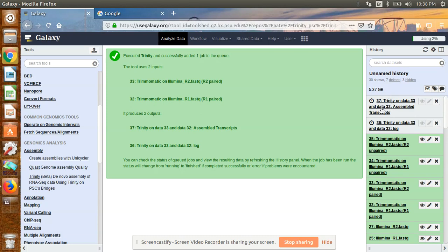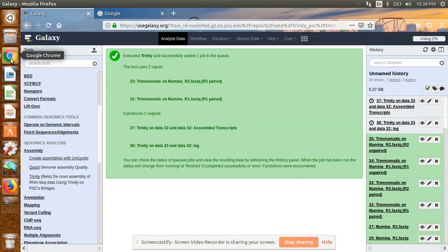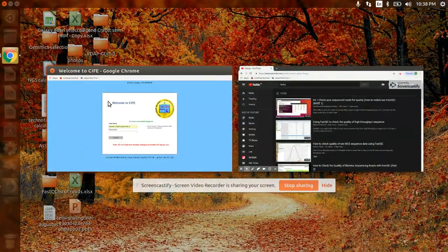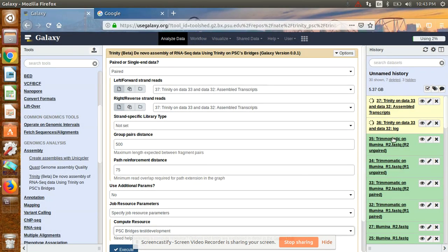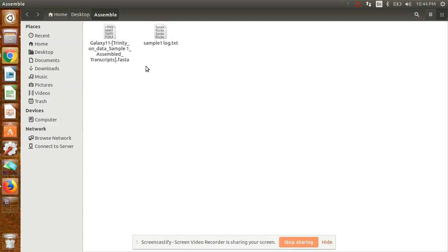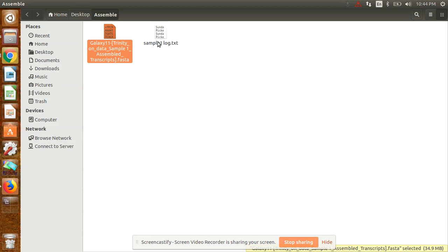Now it will start assembly. As you can see, it will form one log file and one assembly file. It is running now. After getting the assembly, you can download it from here. It will take time depending on your internet speed. I have done it before, so I am going to show you how the file looks. You can download it after it's finished. Going to the file, you can see the assembled file and also the log file in text format.